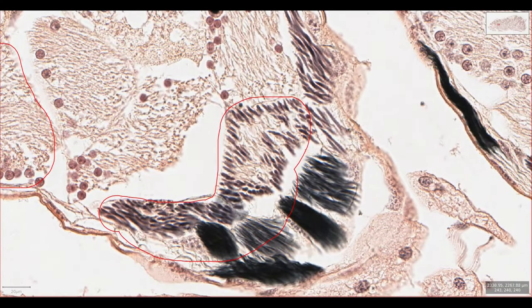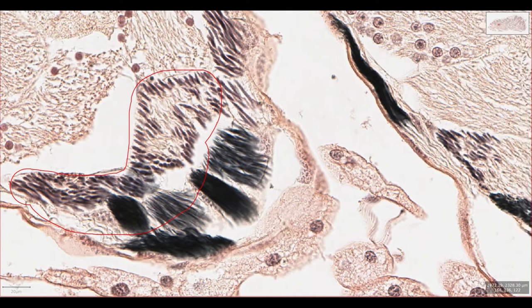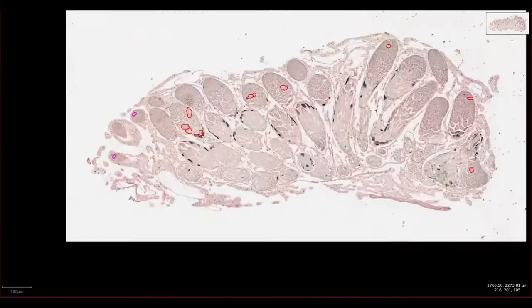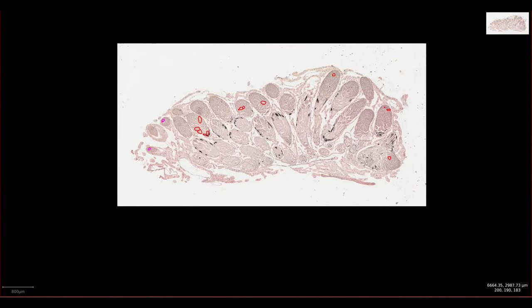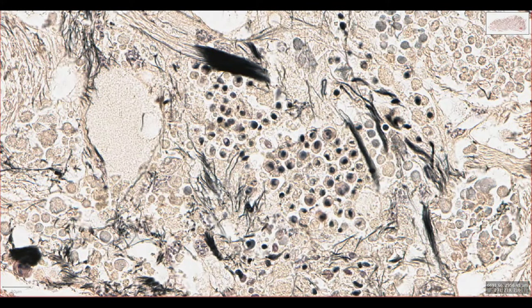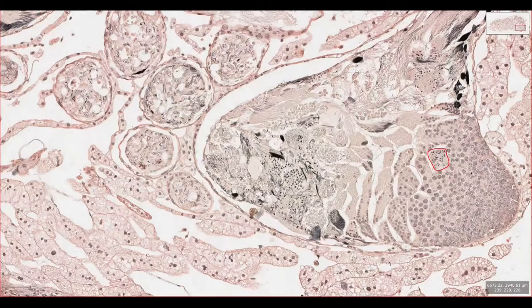What we end up with are these bundles of dark material, which is the nuclei of many spermatozoa, accompanied by this fibrillar material — kind of like this material here — which must be the flagella. You'll also notice some other cells mixed in amongst the spermatozoa. I found some down here. I've no idea what these are, whether they're some kind of support cell helping with the final stages of maturation or the remnants of a cyst. Your guess is as good as mine.